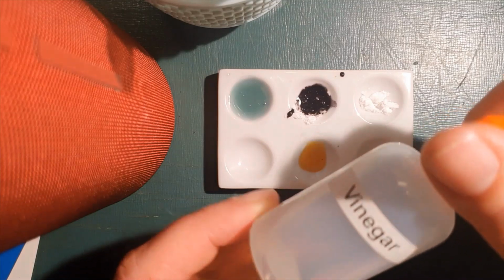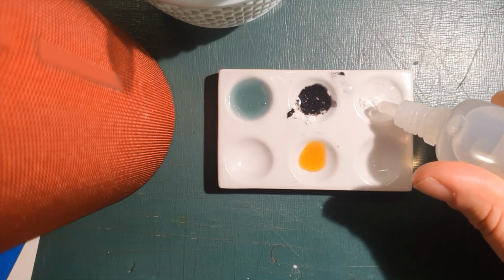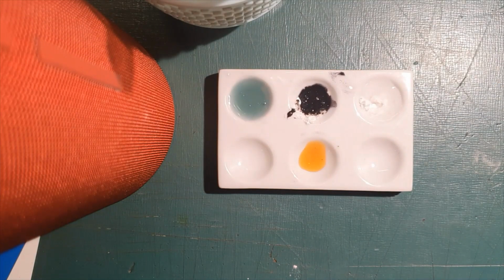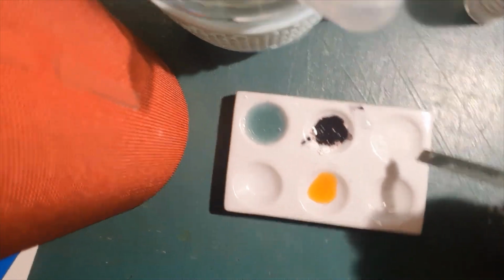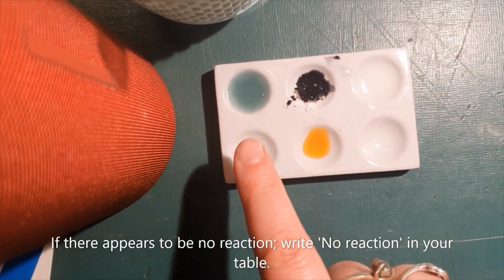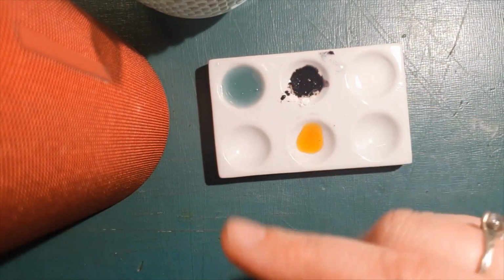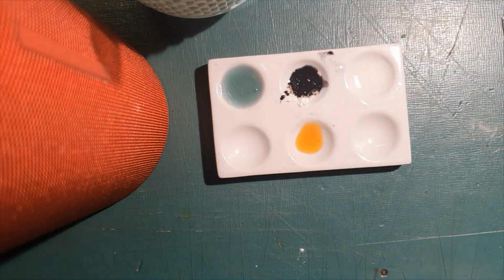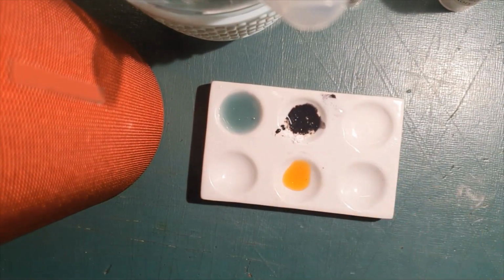And now we'll do vinegar. Let's see if anything happens when we mix it with vinegar. Oops. Not much. It kind of just dissolved. Okay, great. So we've got green in the pH scale. What pH was that? There's a reaction to iodine. Clearly something has happened. What are you observing? Is there a color change? And reaction to vinegar, not really anything.